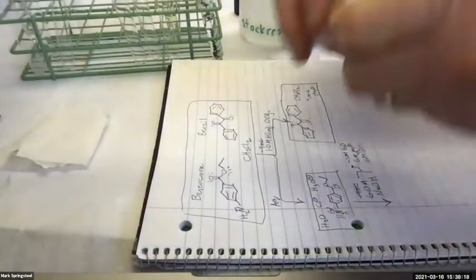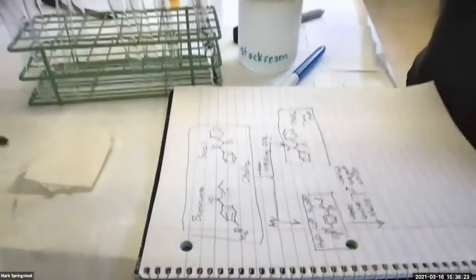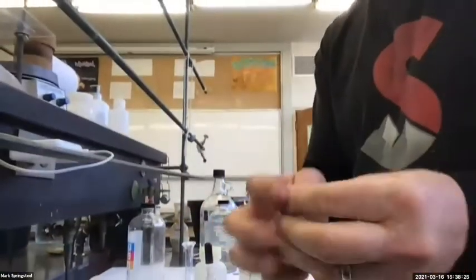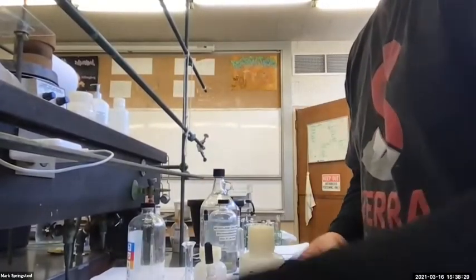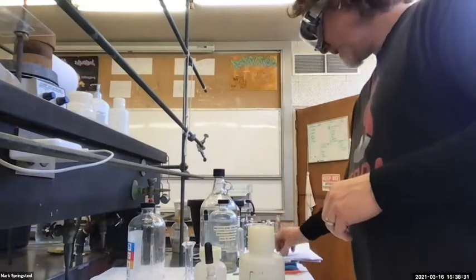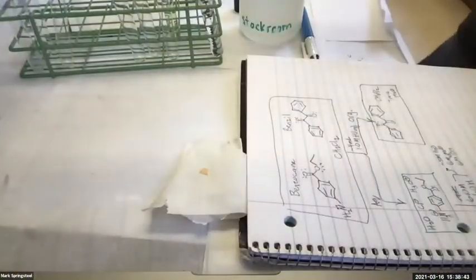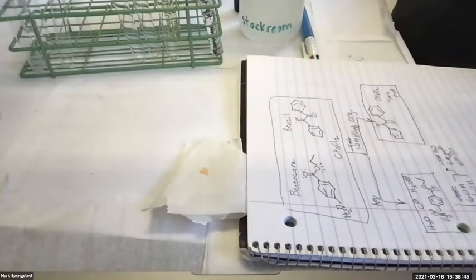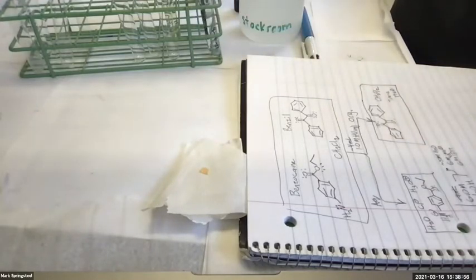Should I just tear off a big long strip and dip it in there? No, I'll just tear off a tiny little bit at the end and stick that on a piece of paper towel. And then I will take a spatula. I don't want to just tip the top of this, barely touching the solution. I want to really put it in there, swirl it around, and make sure it's completely saturated with whatever solution this is.